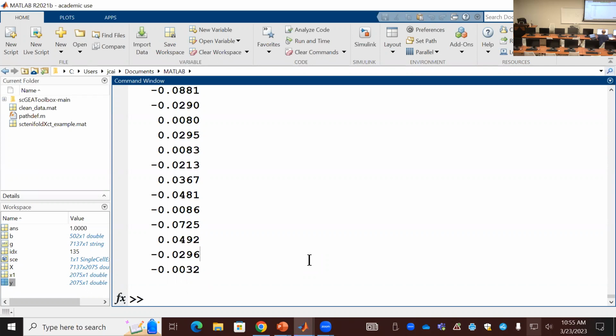Yeah. Yeah, you can do that. You can extract from the interface. Let me start an example.